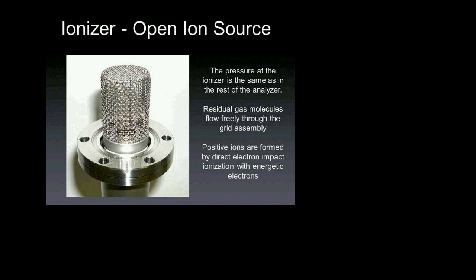And I truly believe that the best way to take advantage of an instrument is to understand how it works. And in the case of an RGA, unfortunately, there are a lot of parts, and all of them can have problems. So the more you know about how the device works, how it's made, what its parts are, the more efficient you're going to be at using it. So we're going to go into this in a fair amount of detail.